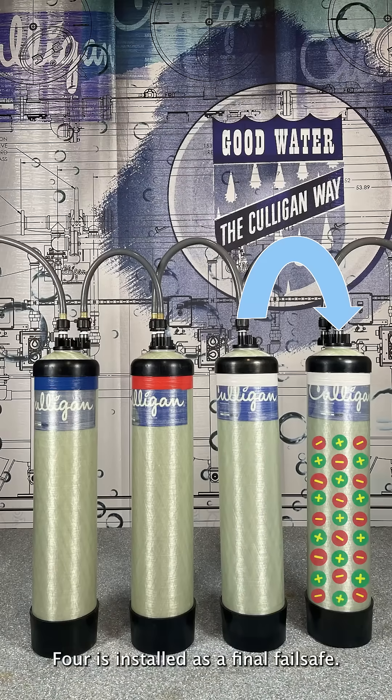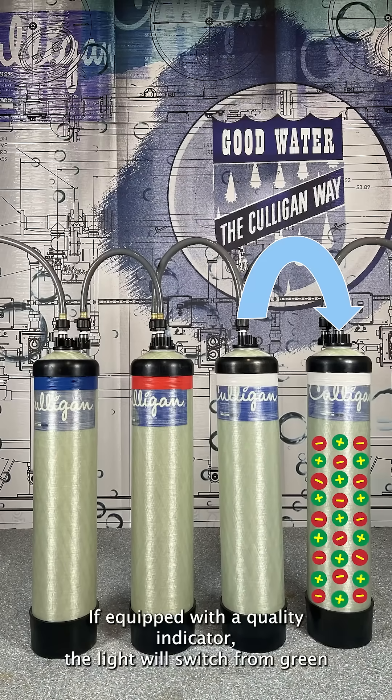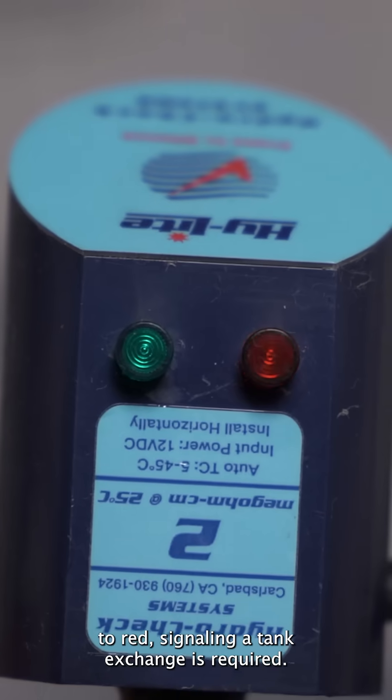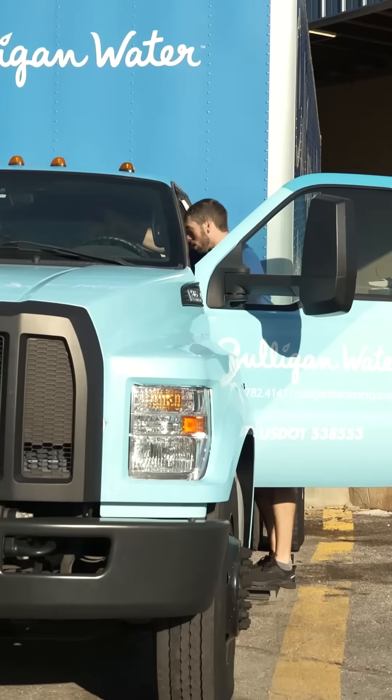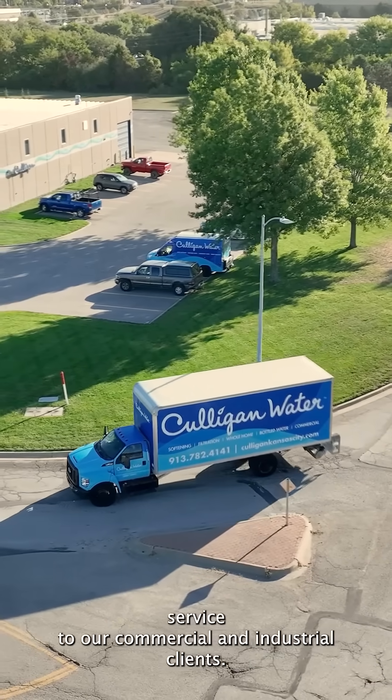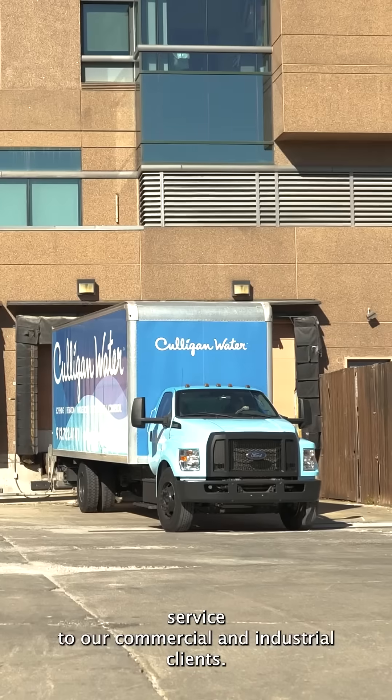Step 4 is installed as a final fail-safe. If equipped with a quality indicator, the light will switch from green to red, signaling a tank exchange is required. This is just one of the ways Culligan water provides service to our commercial and industrial clients.